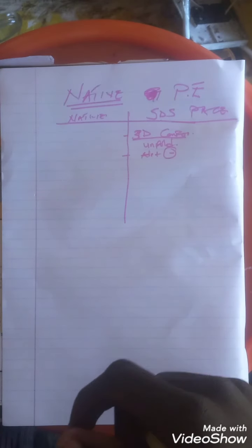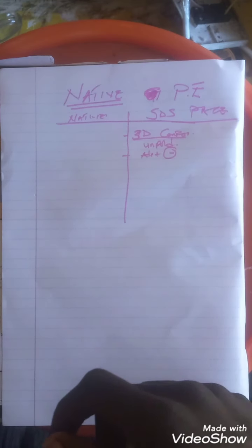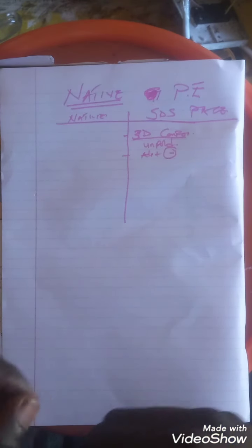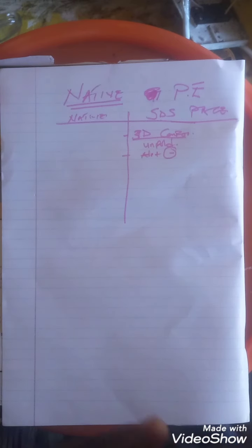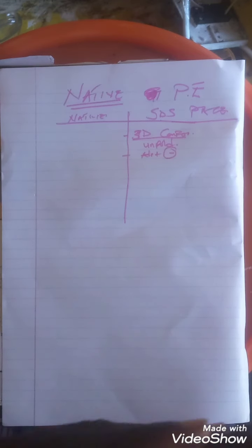And in that previous video, we looked at DNA gel electrophoresis and SDS page electrophoresis. So in this video, we are going to look at four more types of electrophoretic separations, which are native protein electrophoresis, gradient page, isoelectric focusing, and 2D gel electrophoresis.